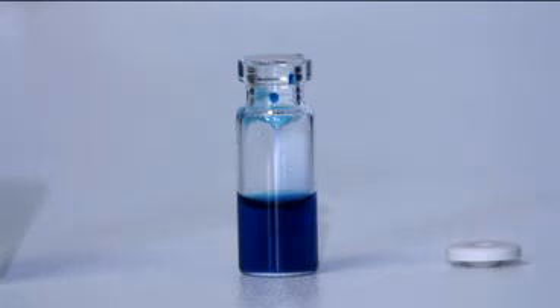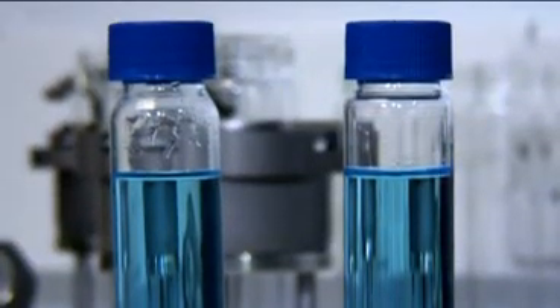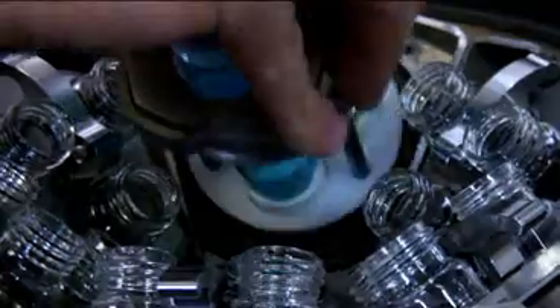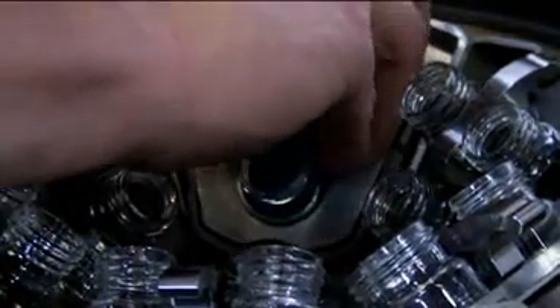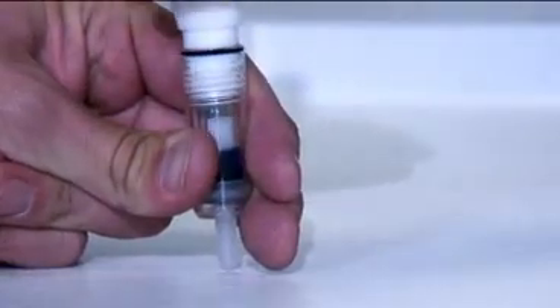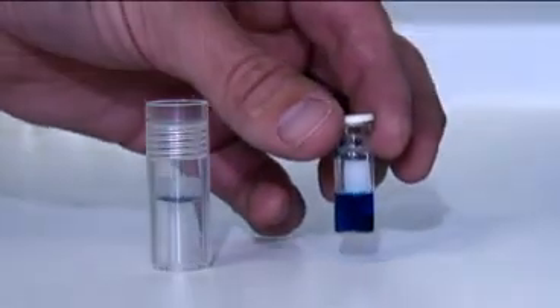A similar system is available for users of ASE vials. The double-ended flip-flop tube is used to collect the extract from the ASE system. Insert a GC vial into the flip-flop funnel and attach to the top of the flip-flop tube. Flip the tube over and place in the Rocket. Remove the second cap. When concentrated, the sample is contained in the GC vial. The flip-flop system has eliminated the need for sample transfer.